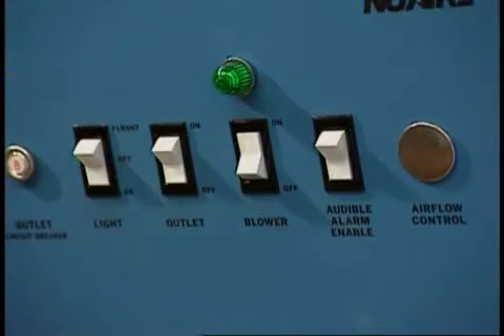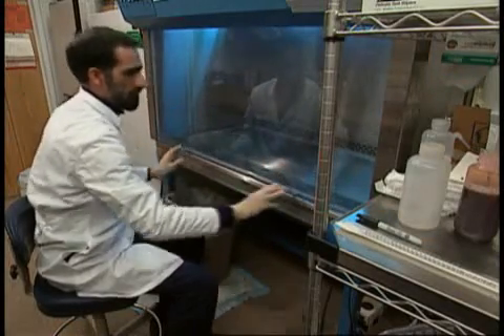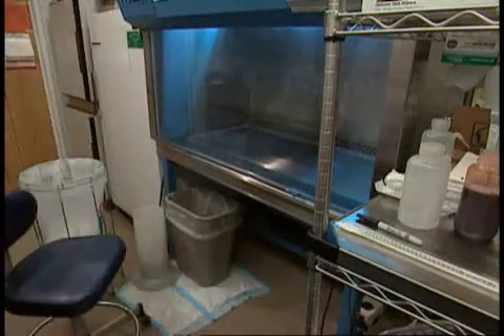He then finishes the decontamination by wiping down the surfaces with a 0.5% iodine solution. Mohammed lets the hood fan run for a few minutes in order to remove any airborne contaminants. As a secondary precaution, ultraviolet light exposure is used to ensure that the work surfaces of the cabinet remain sterile.